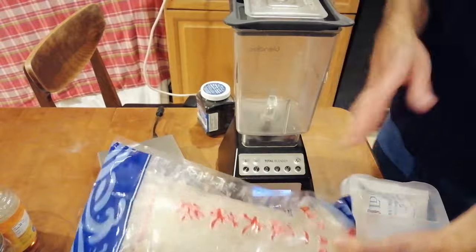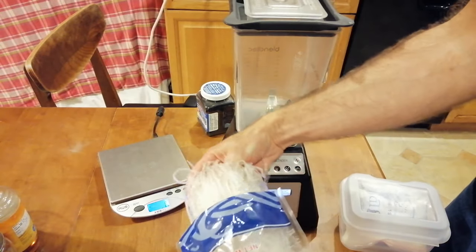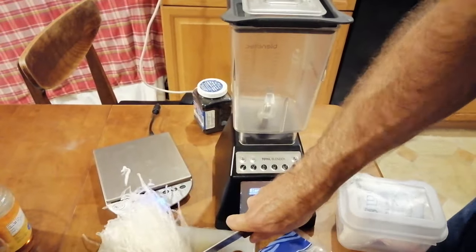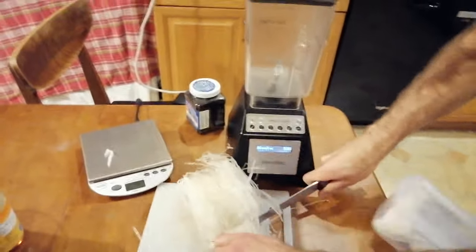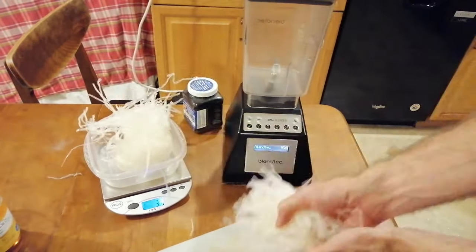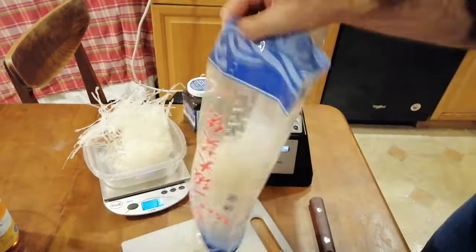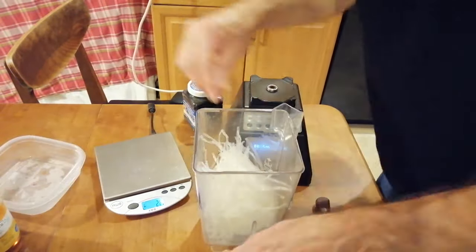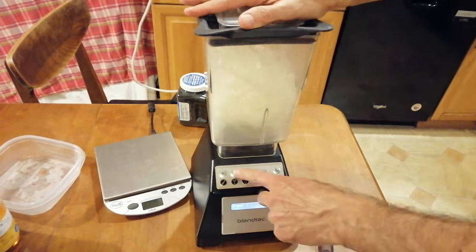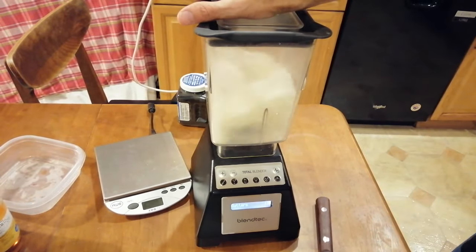Now let's focus on the agar, which is interestingly a seaweed-derived product. You can buy this in already powdered form, but it's usually sold in grocery stores in long strands. You can blend it up to make a powder that's easier to measure out and work with, or use a knife or scissors to cut it into smaller pieces. I'm using a knife to cut the agar up, then I'm going to make 35 grams of powder, weigh it out just before blending. This can be a little tricky — you may have to stop and start it a few times and push everything down to the bottom, but eventually it does blend down to a powder.